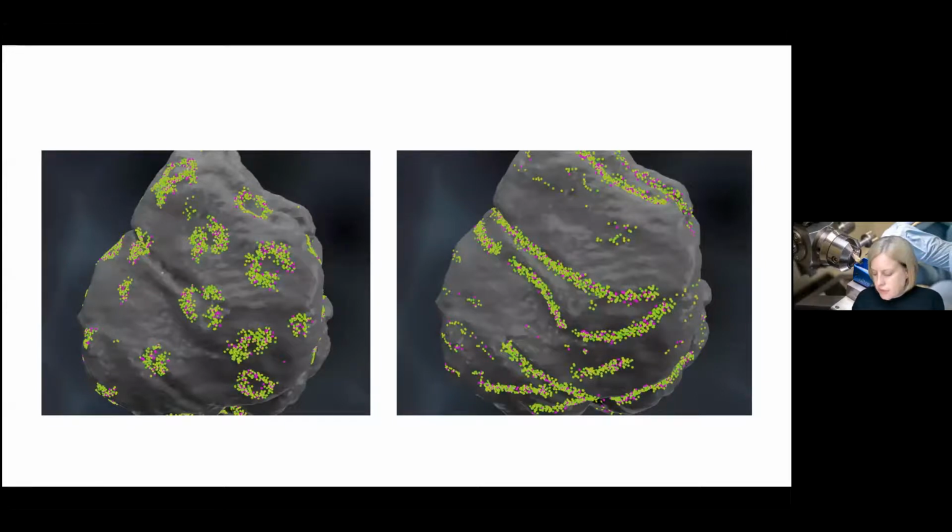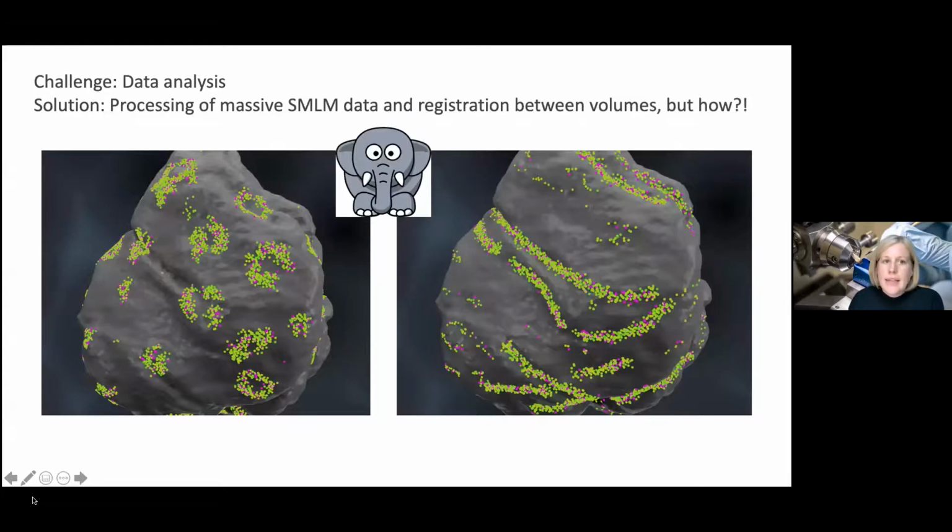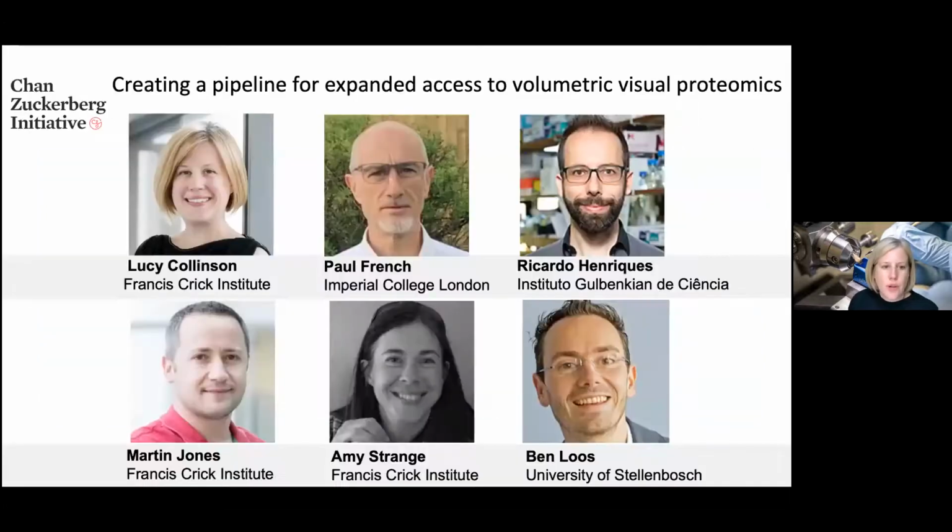So bringing together everything I've told you about so far. And again, the elephant in the room then is the data analysis. So these techniques are throwing out massive quantities of data, and the way that you process and handle these in 3D is not known yet.